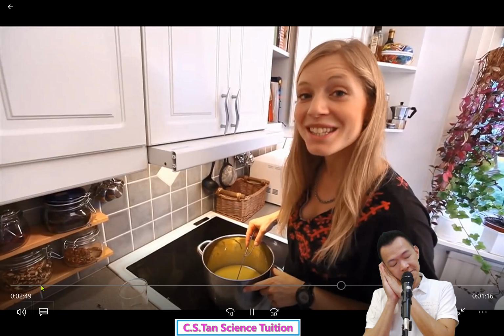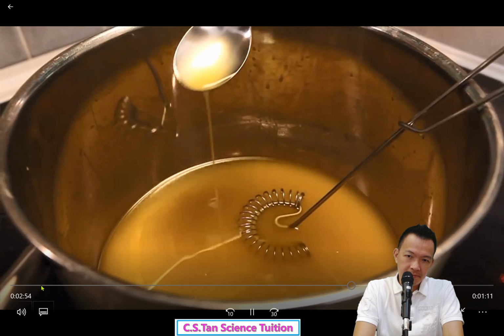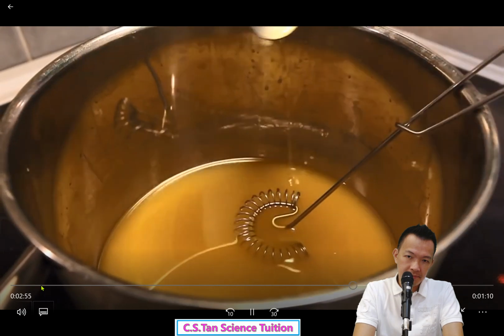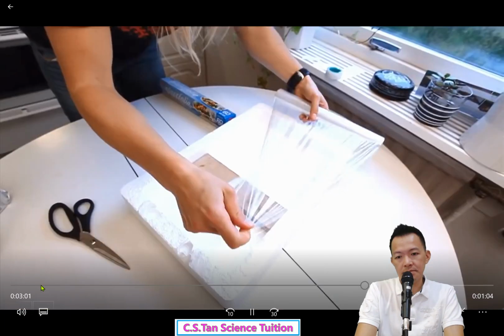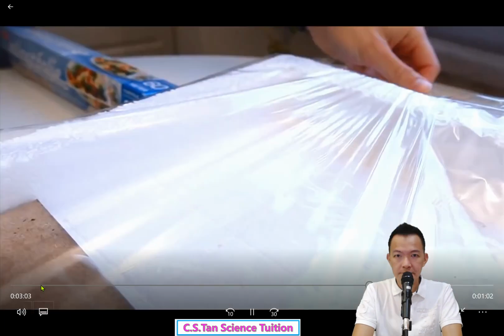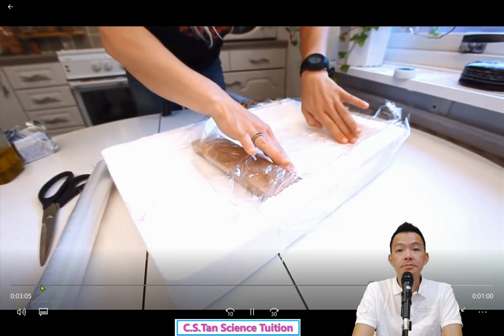Now the two solutions are mixed, but that's not enough. Now we gotta keep on stirring for about 15 to 60 minutes until we see a trace when we stir. So I suggest you guys take turns doing this. While you wait for your mixture to get ready, you can prepare your soap mold. A good idea is to use a large mold and then line the bottom with plastic wrap.